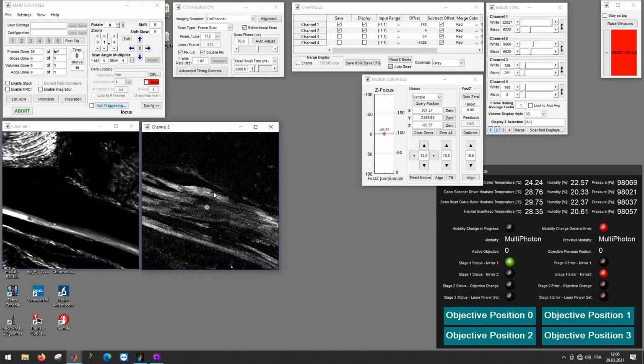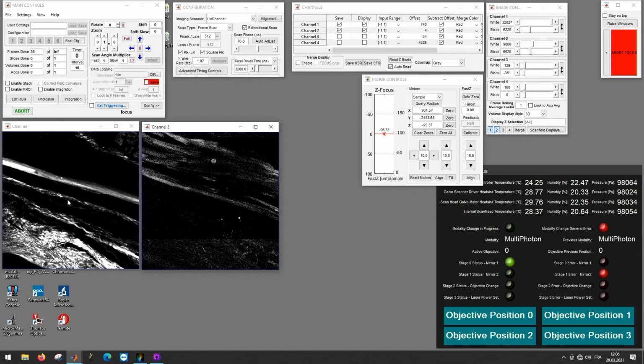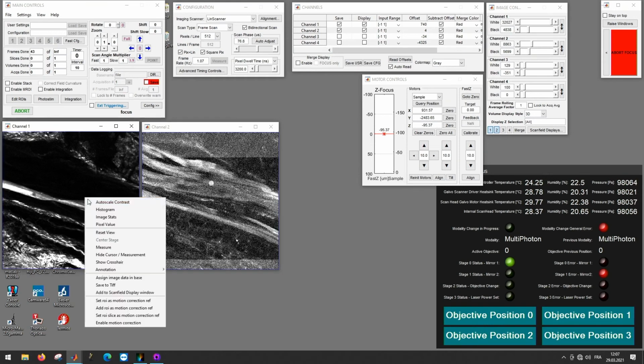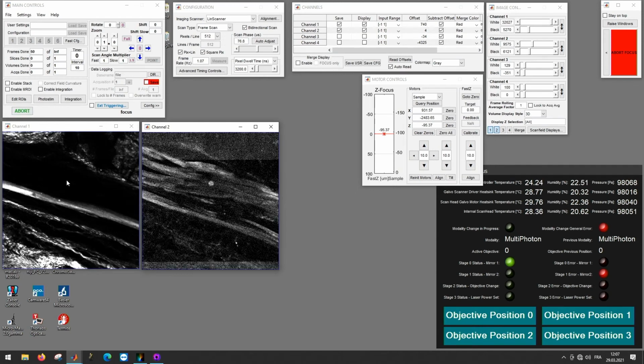I will go to a slightly different region of interest over here, so that you can see the muscle tissue and the collagen tissue a little bit better, maybe over here. And then we can refocus a little bit. So now you can clearly see the differences between single photon and multiphoton, because now we have a very plain image with no real background fluorescence.